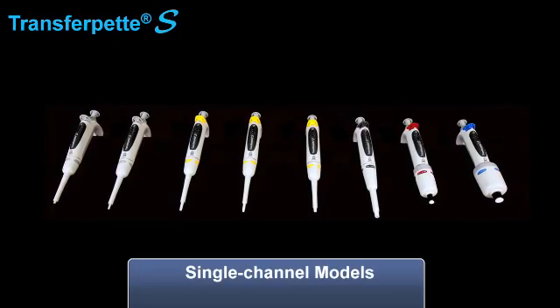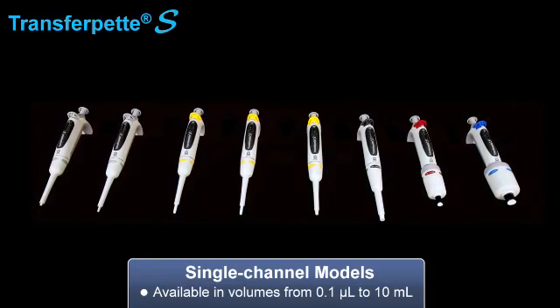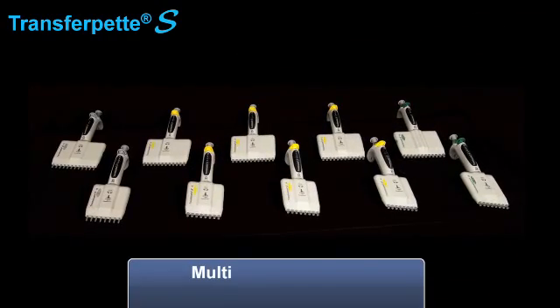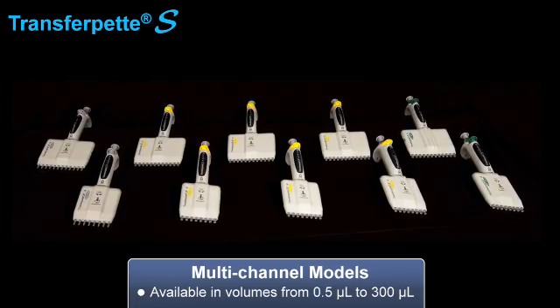The TransferPet S is available in single channel models from 0.1 microliters to 10 milliliters, and the multi-channel models are available in volumes from 0.5 microliters to 300 microliters.